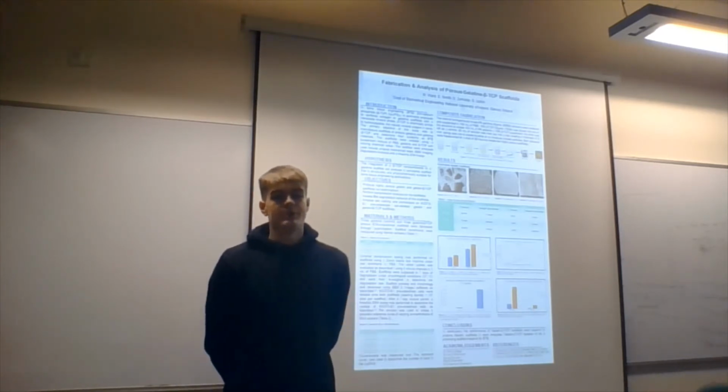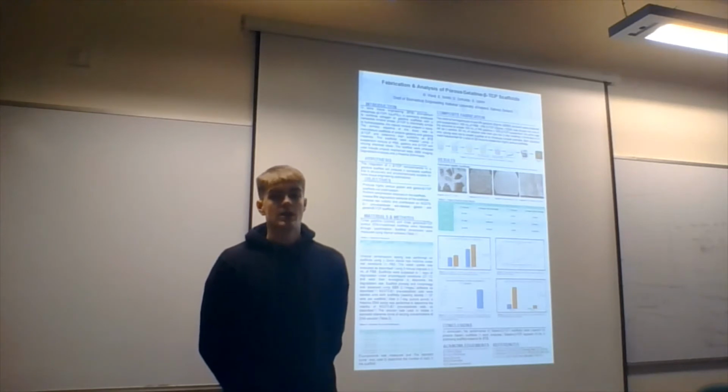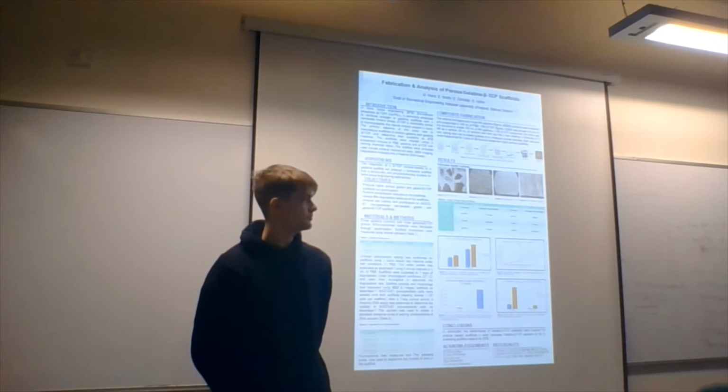This study's objective is to manufacture scaffolds of gelatin and gelatin with beta-TCP and to determine their suitability as bone tissue engineering materials. It was expected that the integration of beta-TCP nanocomposite into a gelatin scaffold will produce a composite scaffold that is structurally and physicochemically suitable for bone tissue engineering applications.